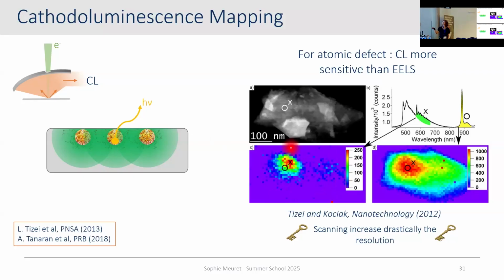The electron-hole pair diffusion should be the same. I think here it's just a question of intensity. So if you look here, the intensity is 250, right? So it's much less light. So maybe you still have carriers, but you have so little light here that you don't see it. It's 1 photon every millisecond, something like this. So the probability is too low. So maybe they're there, but the probability is too low.